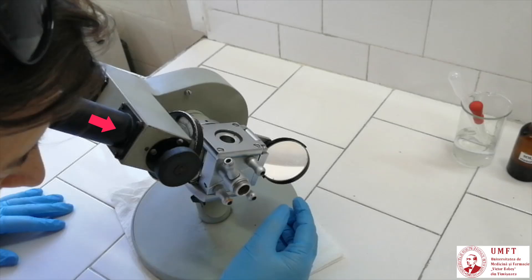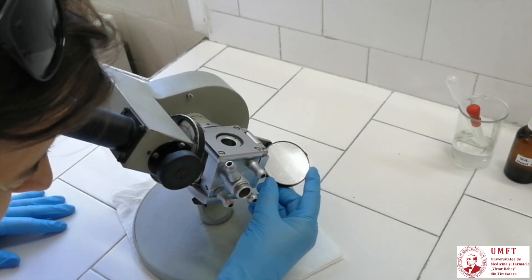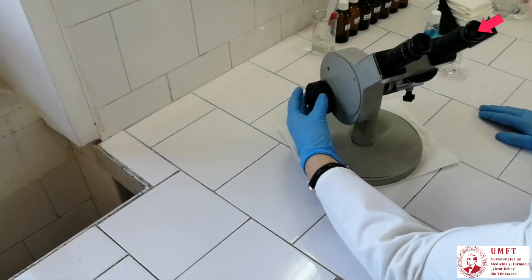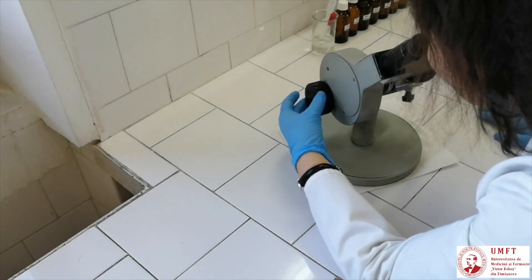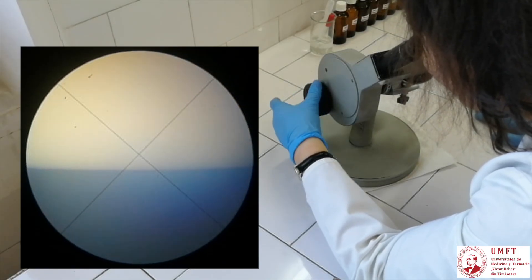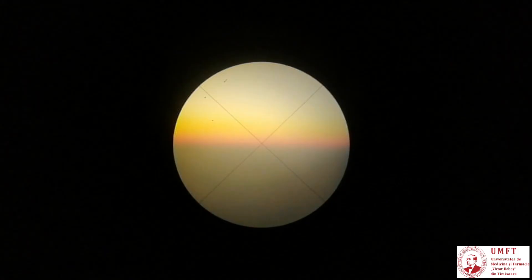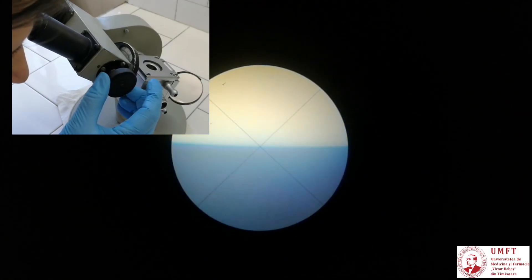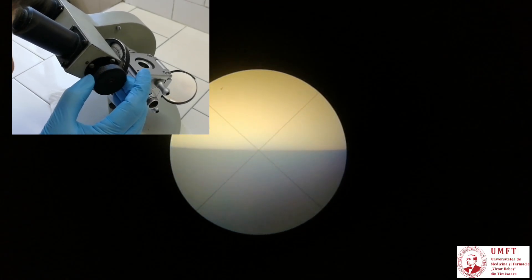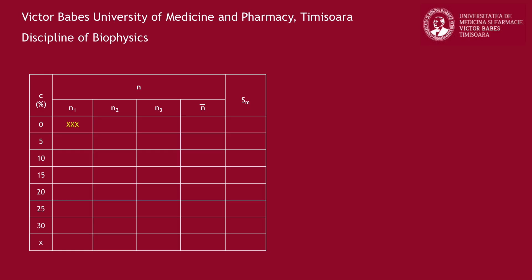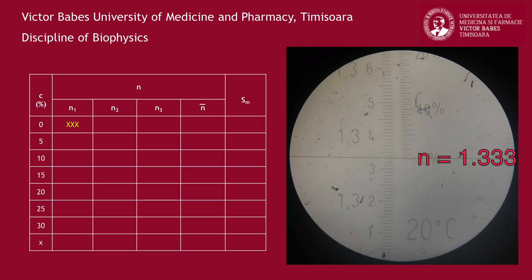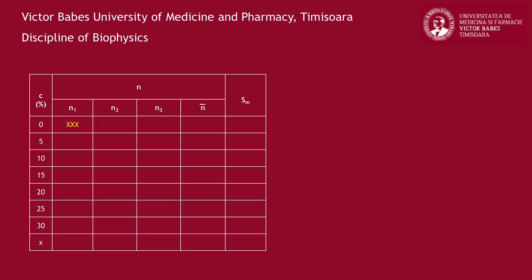Look through the measurement field viewer. Adjust the position of the mirror until the measurement field becomes as bright as possible. Then, while keep looking through the same eyepiece, rotate the big thumb wheel to bring the delimitation line between dark and light to the intersection of the two perpendicular lines. If the delimiting line between the dark and bright area is not sharp or is covered by a band of colors, use the small thumb wheel to correct it. Record the obtained values in the corresponding table of your book. If the measured refractive index of distilled water is very close to the value 1.333, you can conclude that the refractometer is calibrated and can be used for further determinations.